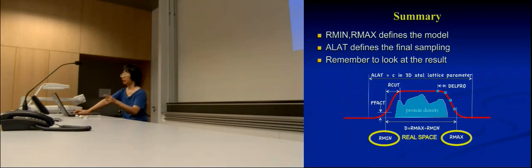Okay? When you get to this point, you have a 3D plot of your data points. What you will find is that instead of getting one line, your data is going to aggregate into 2 lines instead of 1, because some of them are supposed to be at a different value from the others.